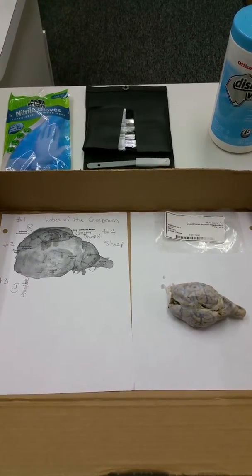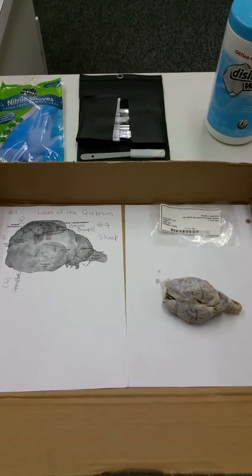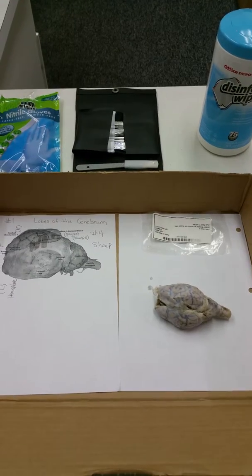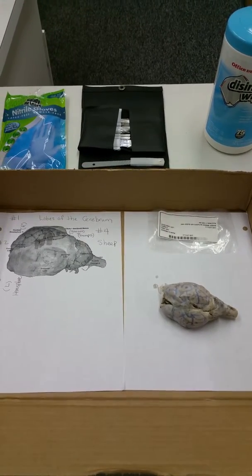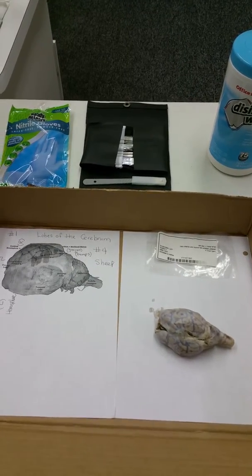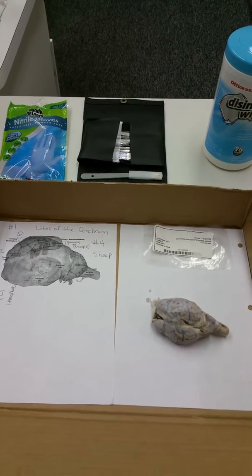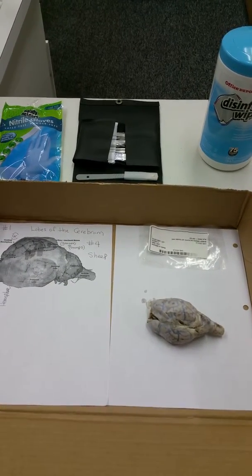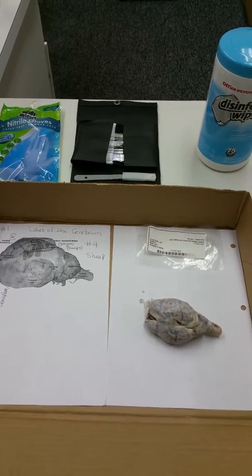So as we can see, the sheep brain is quite smaller than the human brain in regards to the proportions, and also the sheep has a smaller cerebrum. Now the sheep is oriented anterior to posterior, so this way we can look at it like a body. Now the most prominent feature of the brain obviously is the cerebrum.